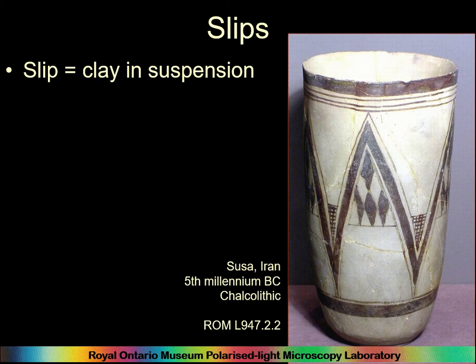This is how ancient pottery is painted. It's not just a paint. It tends to actually include, not always, but typically it will include clay. And so it's in this case, probably this is maybe manganese or iron added to clay, and then that is painted to the surface and then fired.